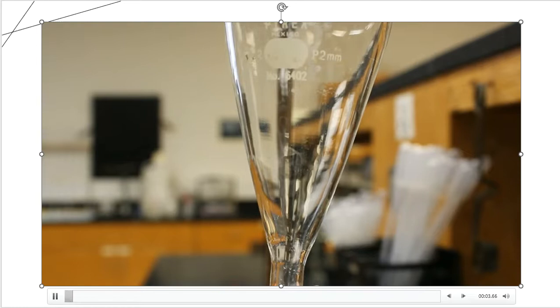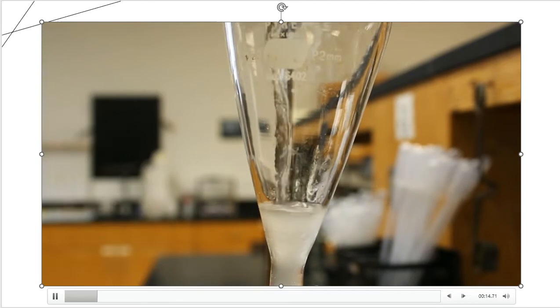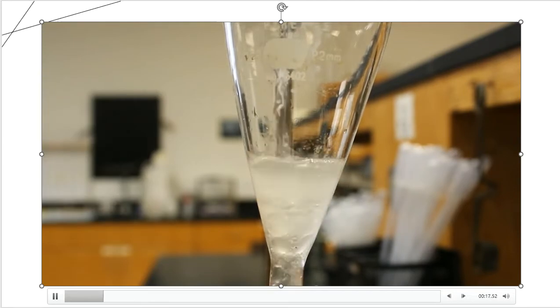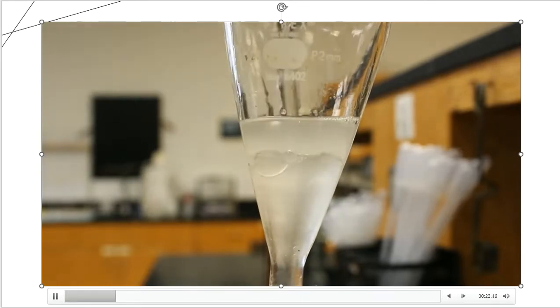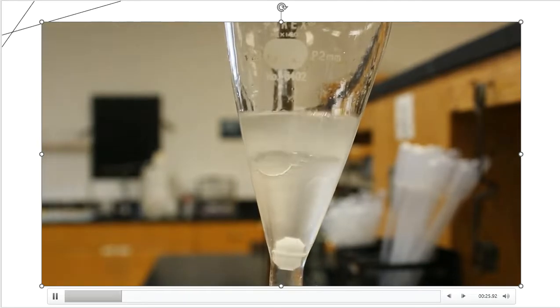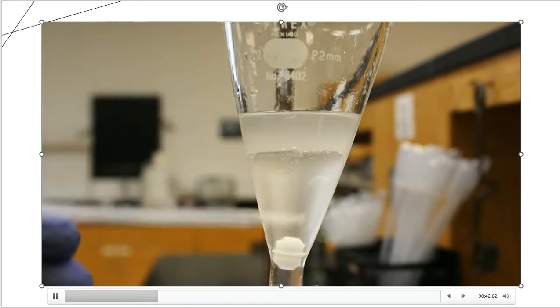Okay, so I've got a new separatory funnel here, and the purpose of the separatory funnel is to separate. So I'm going to pour this anisole product solution into my separatory funnel. I'm going to make sure that it's closed, of course, and I'm going to see that two layers begin to separate in the separatory funnel. There's going to be a water layer, and then there's also going to be more of an organic layer. So I can see that there. My magnet, of course, has fallen into the separatory funnel, and that's not a big deal, folks. I can get that out quite easily, but you can see two different layers distinctively in the separatory funnel. I see one here, and then I see one here.